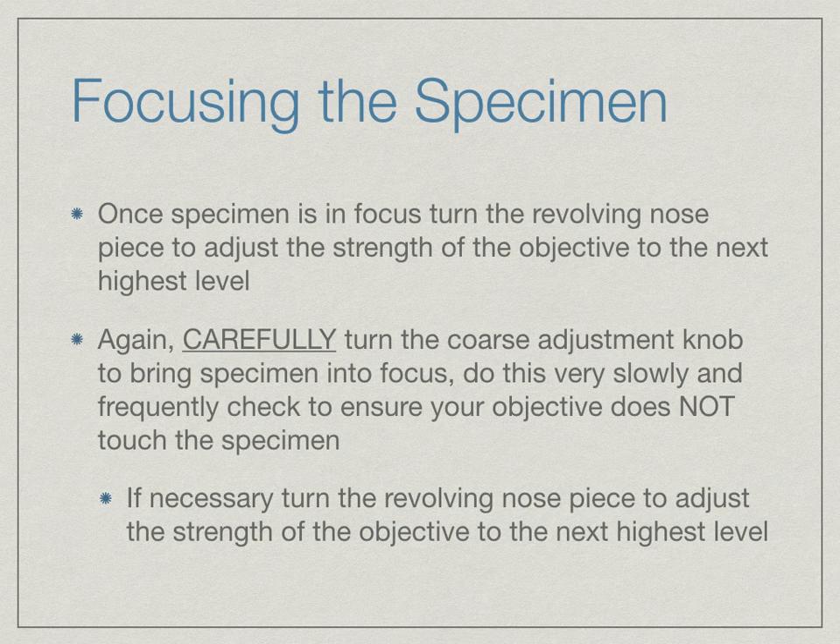Once the specimen is in focus, turn the revolving nose piece to adjust the strength of the objective to the next highest setting. Carefully turn the coarse adjustment knob to bring the specimen back into focus. Do this very slowly and frequently check to ensure your objective does not touch the specimen — you will need to remove your eye from the eyepiece and physically look at the side of the objective and where your slide is to make sure they are not touching.